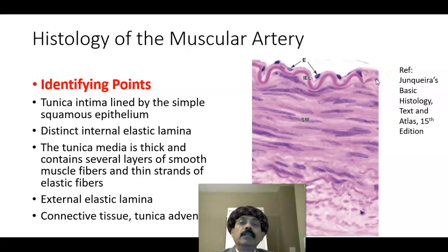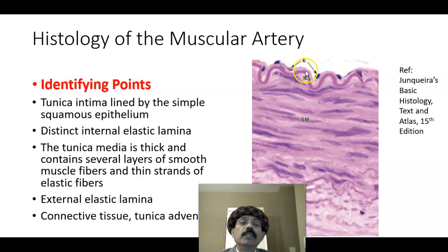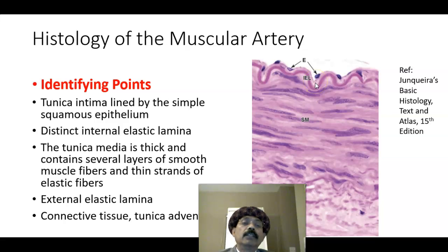This internal elastic lamina is very distinct in a muscular artery. Muscular arteries are also called medium-sized arteries or distributing arteries, and they are the most numerous arteries. The endothelial cells are composed of simple squamous epithelium, and the subendothelial connective tissue is thinner and less distinct compared to that of the elastic artery.